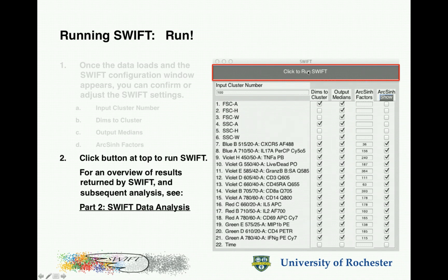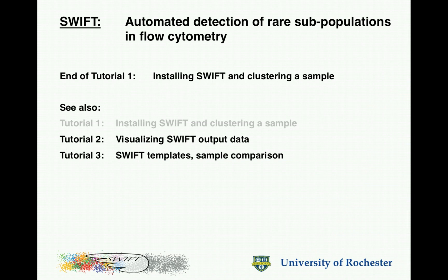So once these parameters have been set, you're ready to proceed with the actual clustering run. Simply click the button at the top and Swift will start to analyze the data and write the results into the same folder. All of the samples in the folder will be processed without any further input using all the parameters you've just set up. Once that's all finished, you can move on to tutorial two, which talks about visualizing the Swift output data and manipulating it for examination and analysis. Tutorial three describes how to extend the Swift clustering to multiple samples by making Swift templates, assigning those to many samples, and then rigorously comparing between samples.